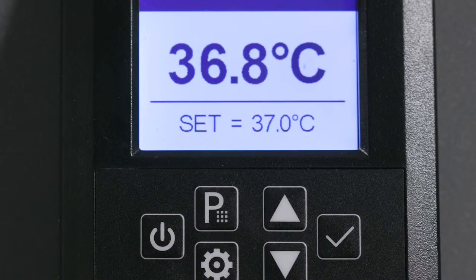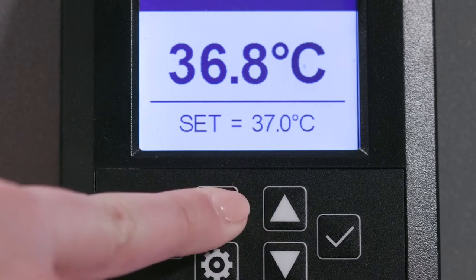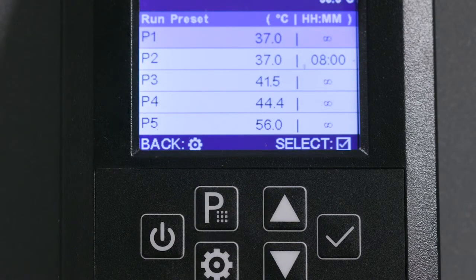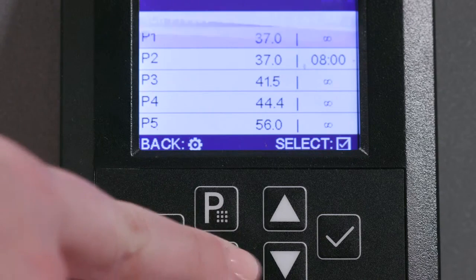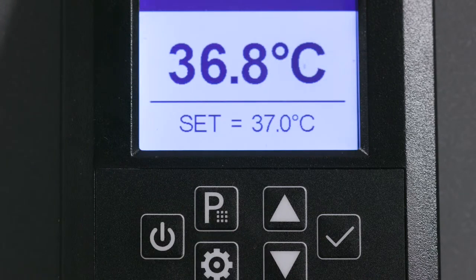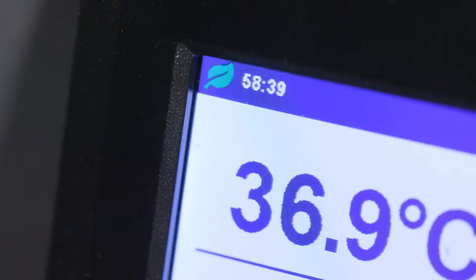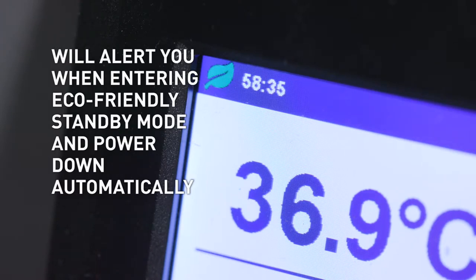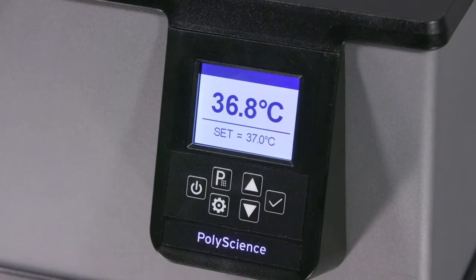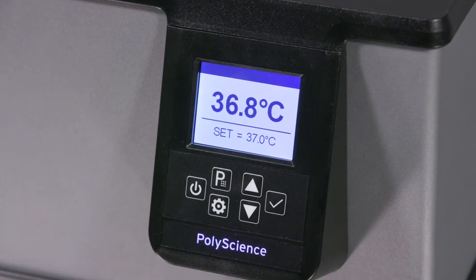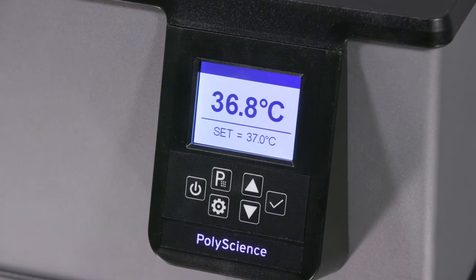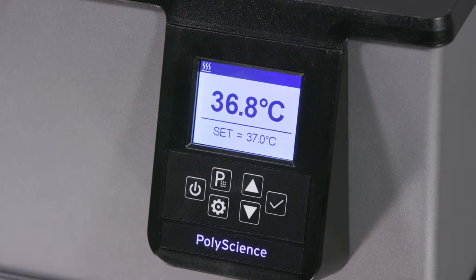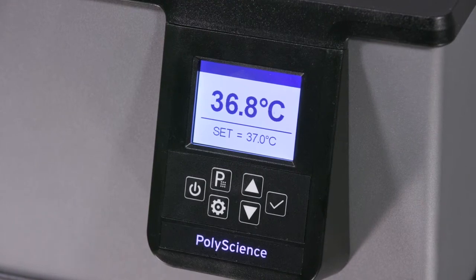Now you are able to select a preset temperature, let it run for the exact time and temperature you want, and when it's done your PolyScience water bath will alert you that it's about to enter an eco-friendly standby mode and power down automatically. This function not only increases energy efficiency but safety for you and your lab.